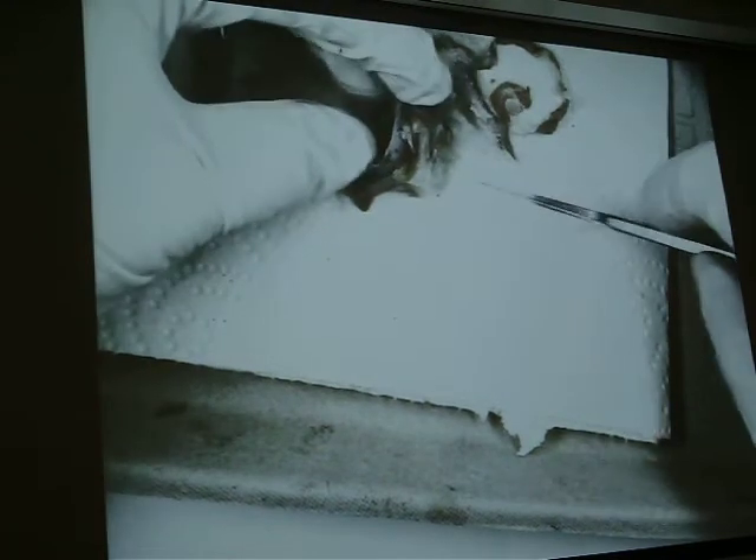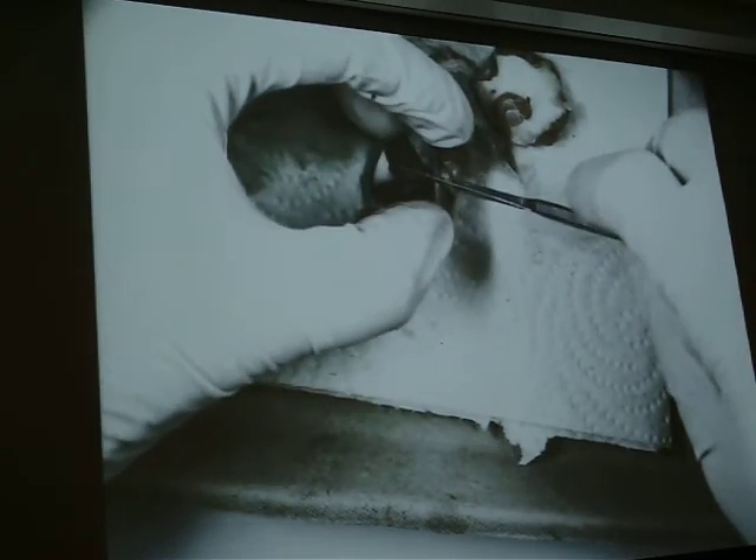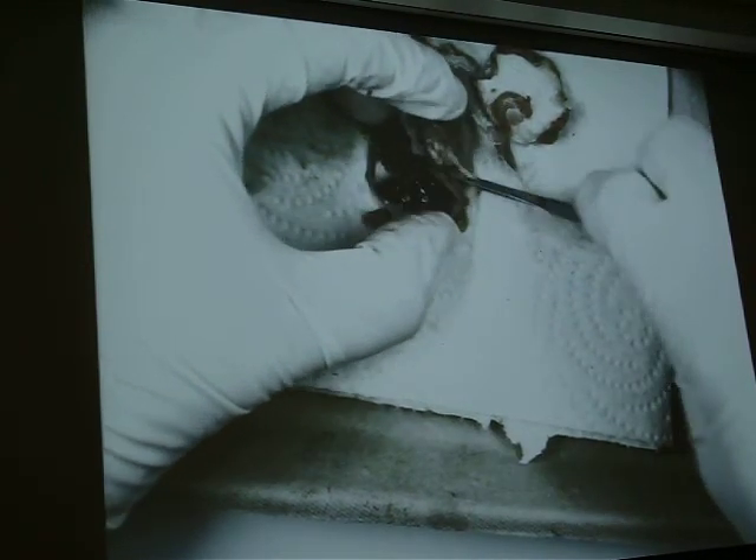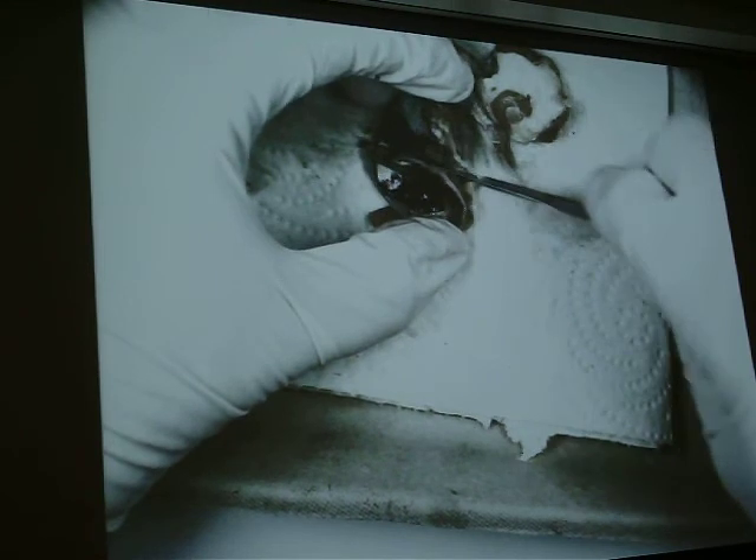Try to cut through both of them at once. I can see both of them at once, so we're just going to try to go through that without cutting myself, we hope. And if you've done this in the right place — there's the optic disc, and there's the optic nerve. I think I'm a little bit off, but I've got the edge of it. That's good enough for y'all to get started on.